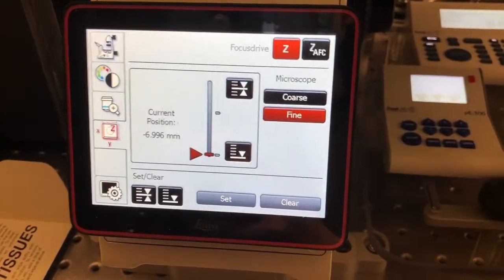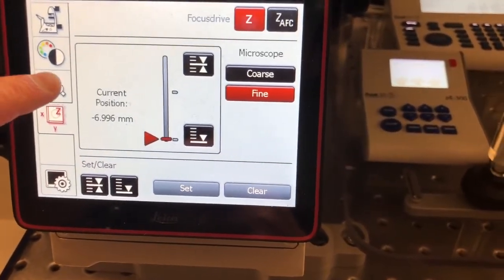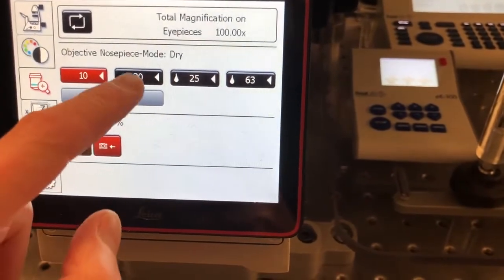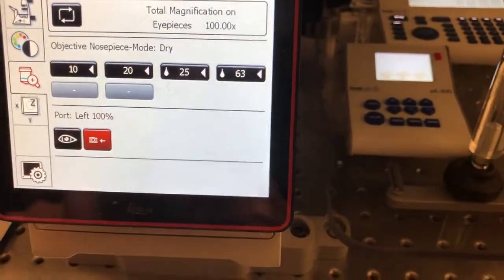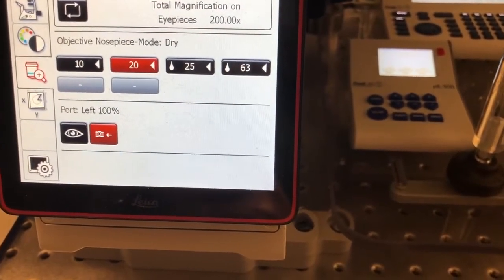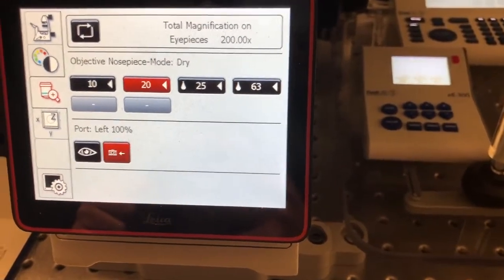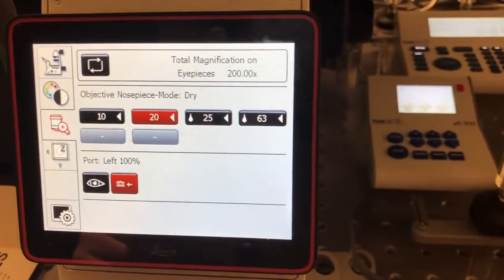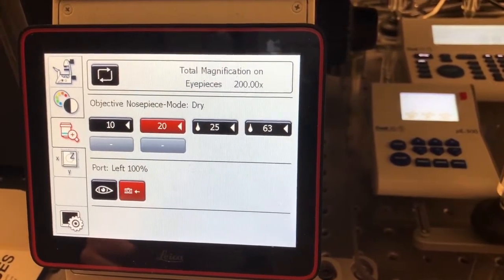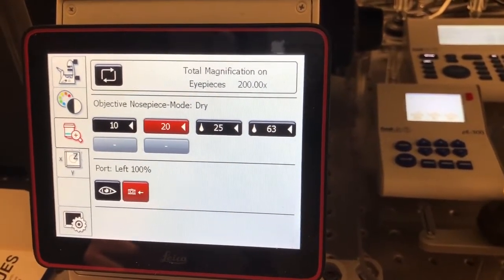To change objectives you can do that through this menu, and just press the button for the objective you want to change to. If you are switching between two objectives of the same type — either air objectives or immersion objectives — the objective will just change and go to the same, or rather par focal, position.